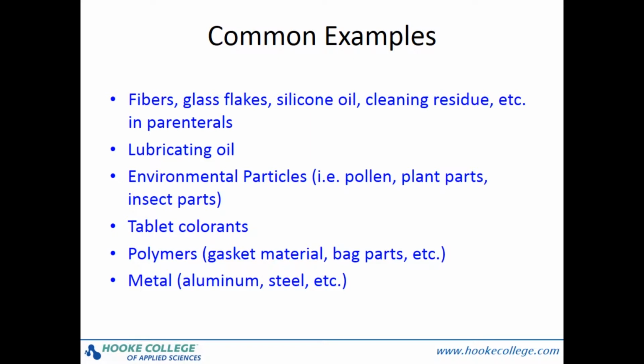Some years ago I worked with transdermal patches like the nicotine patches that people use. I was examining them for crystals in the adhesive when I found diatoms. How would diatoms get into a patch? Well, transdermal patches are a sandwich of 2 plastic pieces with an adhesive with the drug in between them. Turns out one of the plastic pieces had a light dusting of diatomaceous earth to keep the rolls of plastic from sticking to itself before being made into the patches. Hence the diatoms in the patch.